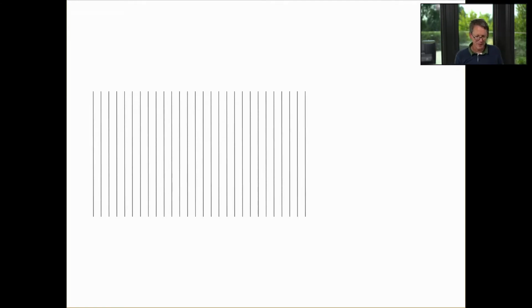And so in this next animation, in this cartoon animation, I would like to illustrate the principle of imaging in an optical microscope. Here you have a plane wave traveling from left to right. You can see it travels in this direction, so you have a plane wave front. The light travels to the right.